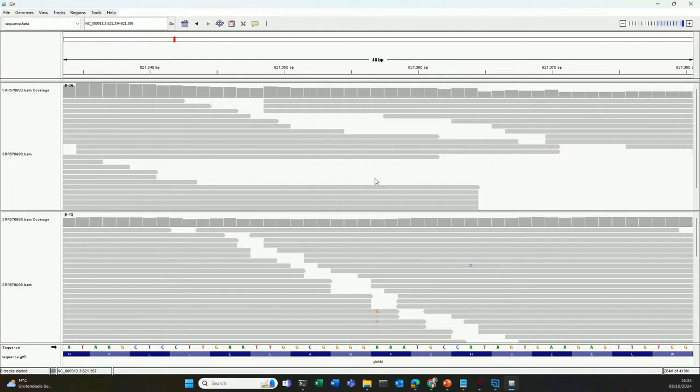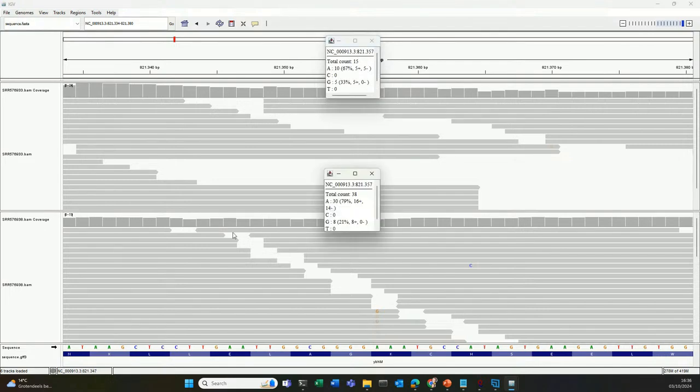So in the position where a lot of colored Gs appear, you can also click this track, which is called the coverage track. So when you click the coverage track, you also get more information. Of course, you cannot look at the whole genome. You will typically focus on your favorite genes to see what is happening there.